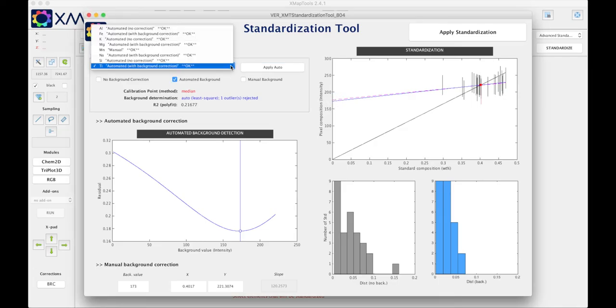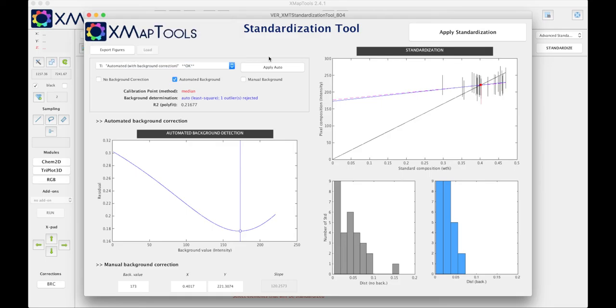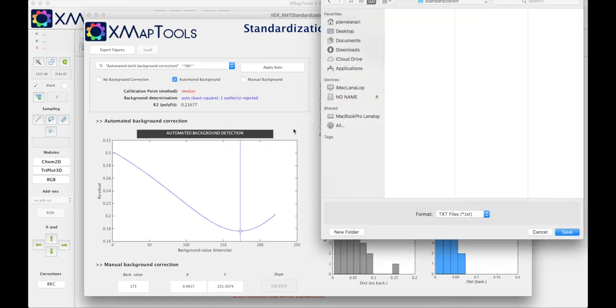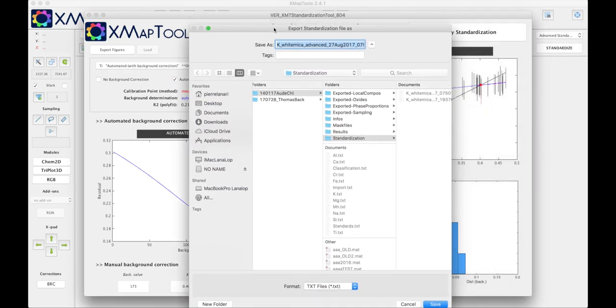When you are done all the elements should be written okay, which means that we defined a calibration curve. When it's okay you can press the button apply standardization and the program will close the standardization tool. It is possible to export the standardization parameter by clicking on yes. In this case you can save this parameter.